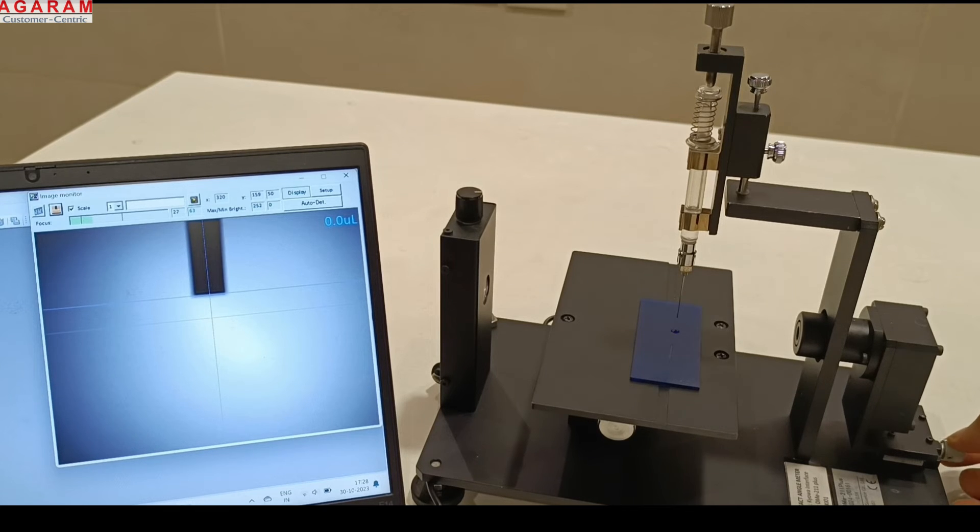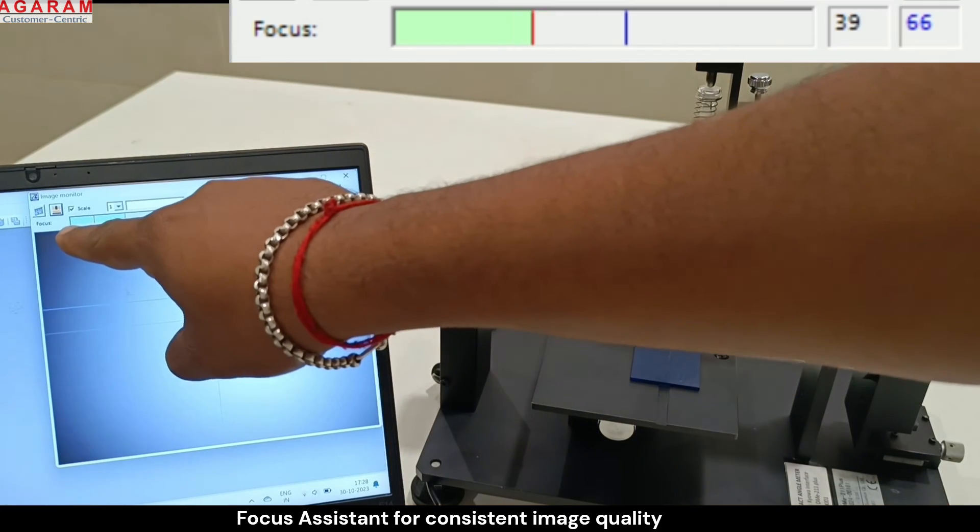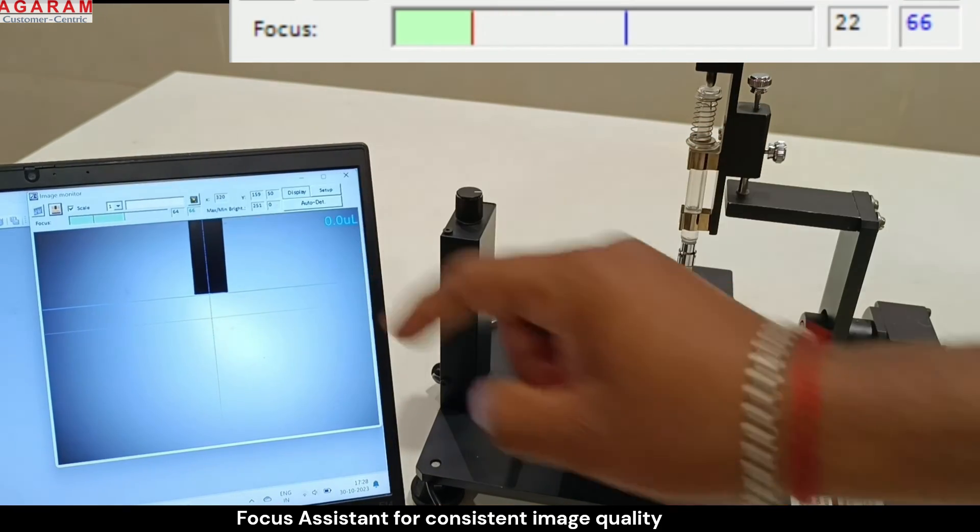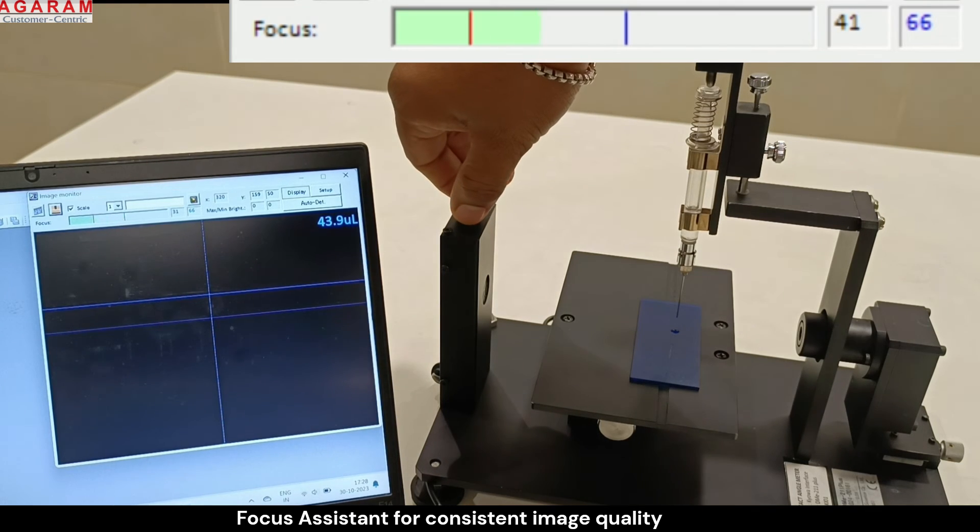The intuitive focus assistant makes it easy for you to objectively tune the camera and light to get the maximum focus. You will see a real-time focus bar telling you the percentage of focus it is in. We prefer it to be at 70.